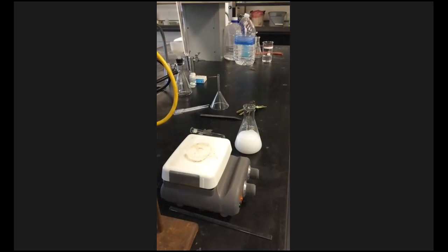And if you notice, the covering of the hot plate is ceramic. That's on purpose. You're an engineer, right? Okay. Do we have any engineering majors on? No? Okay. Well, the material that the hot plate is made of is ceramic, like a ceramic type polymer. Very good conductive heat. Excellent conductive heat. So that's why you need something like that.